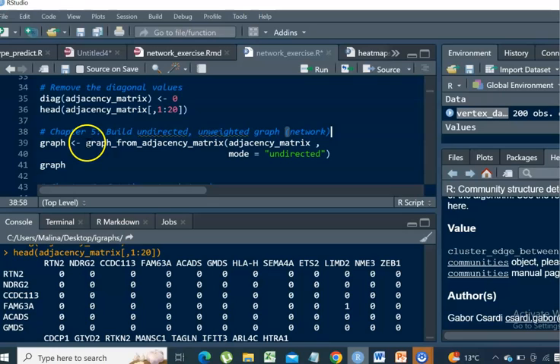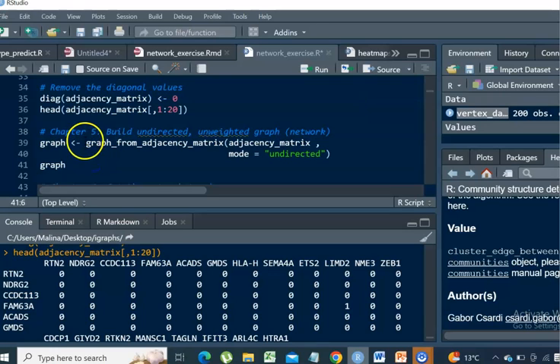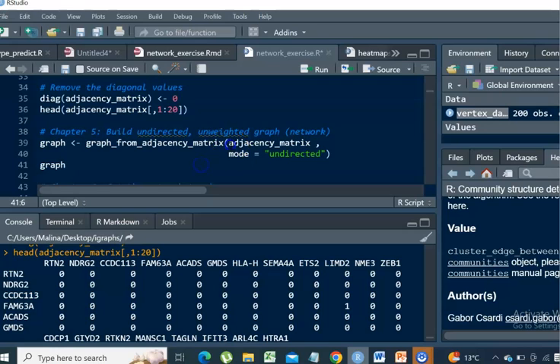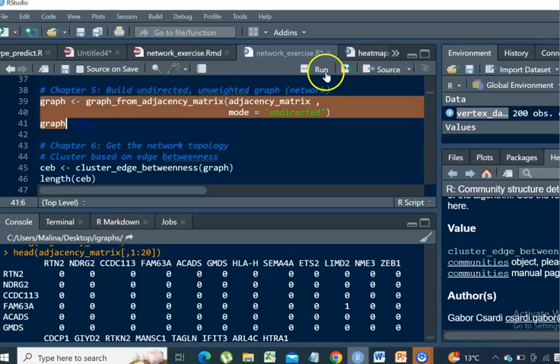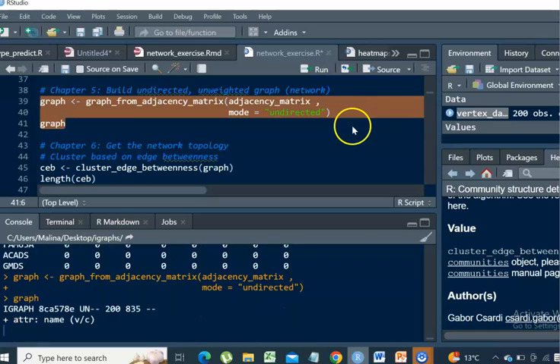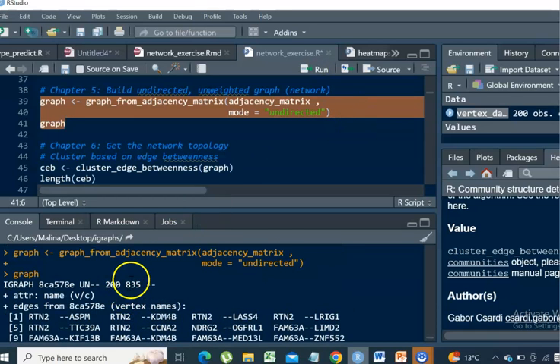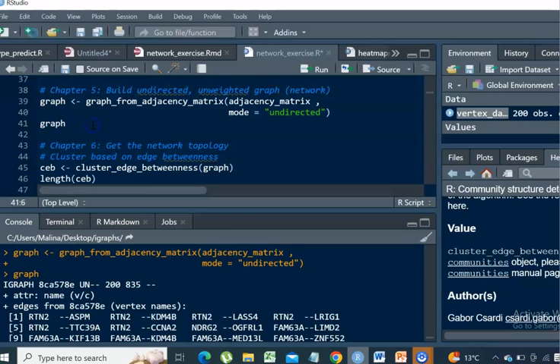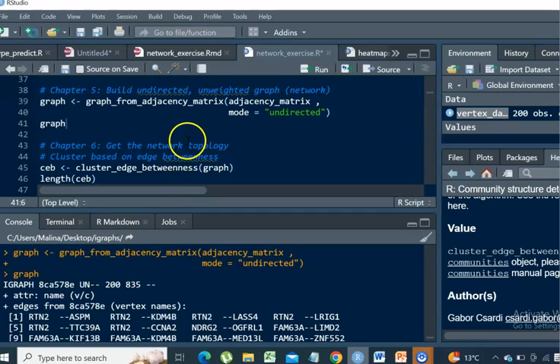The function from the iGraph package that we are going to use to generate the interaction network is graph from adjacency matrix. So we just put the adjacency matrix as an input and we are ready to generate our co-expression network. So that's it. What we can quickly see by just running or executing the graph that we just generated is the fact that we have 200 nodes. We already know that because our initial data frame that we started to work with had 200 genes. And apparently there are 835 edges between these 200 genes that happened to have one in the adjacency matrix.